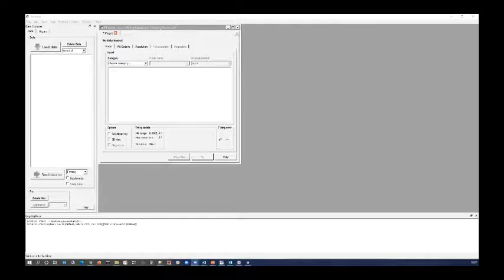Okay, welcome back, everyone. So in this half of my session, I'm going to basically do stuff in SasView. It's going to be a whistle-stop demonstration of its capabilities, I'm afraid, but pretty much all of the example data I'm going to use is from the test folder that ships with SasView. So if you download the program and install it and then play back the recording of this session, you'll be able to practice what I'm about to show you.